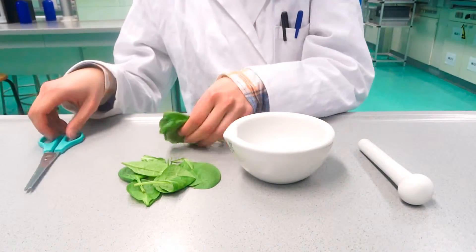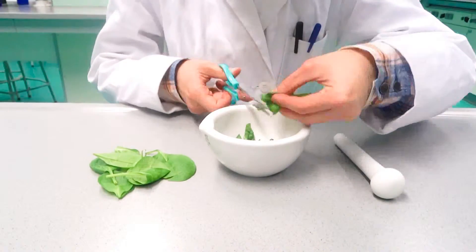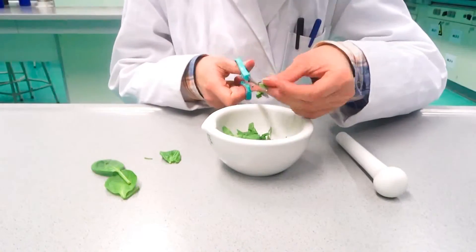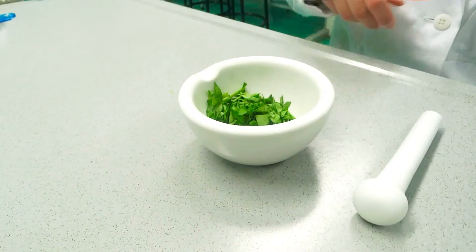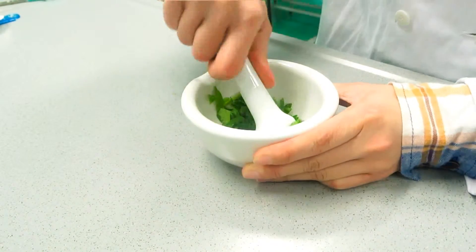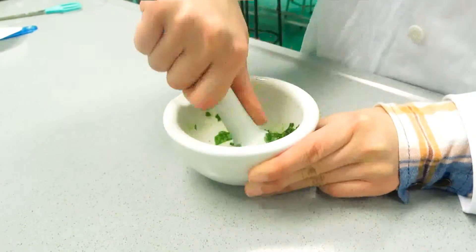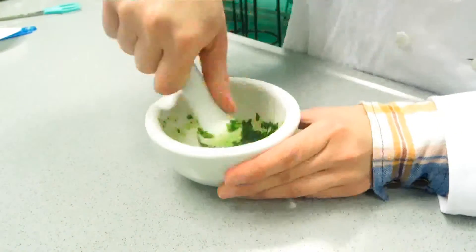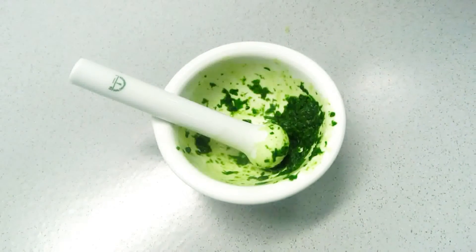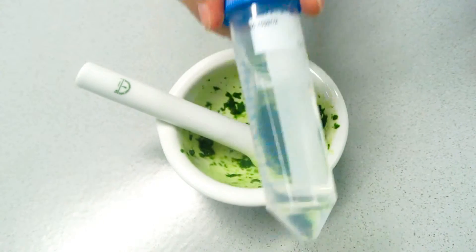Take the leaves and cut them into small pieces — the smaller the better. Then take the pestle and grind the leaves until it's mushy. Add a little bit of rubbing alcohol or water, just to cover the leaves, and mix it.